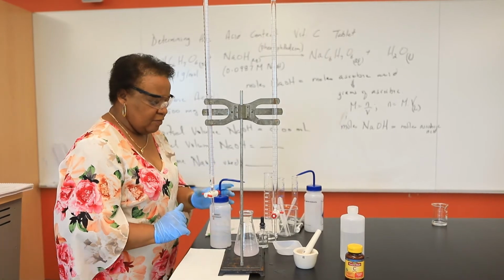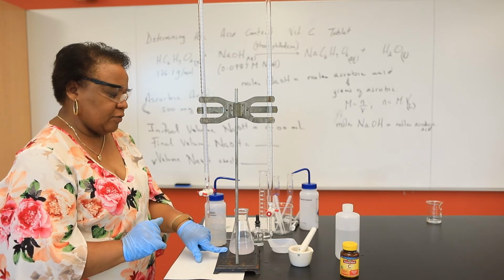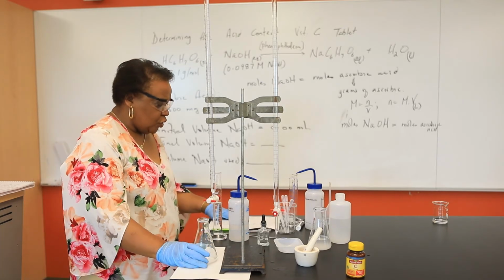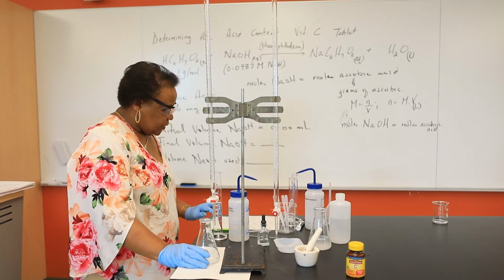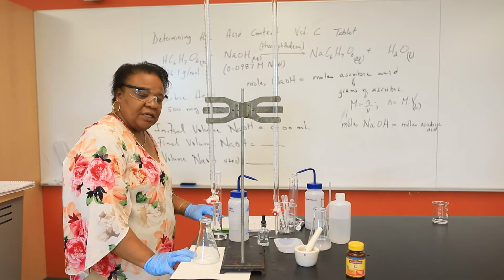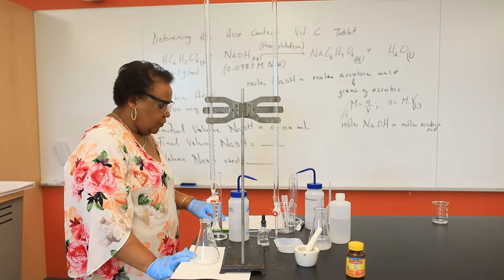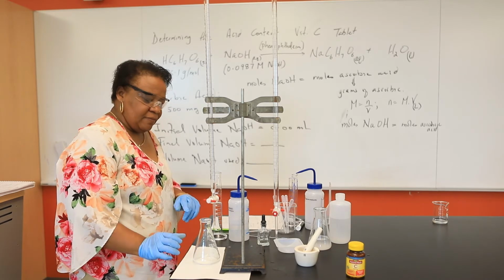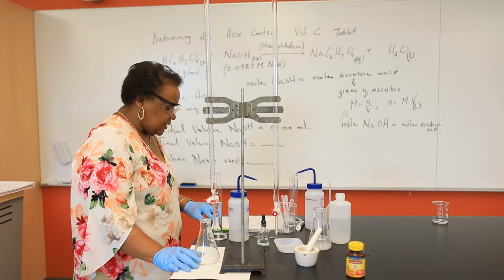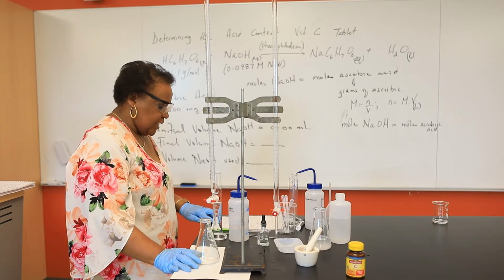I'm going to repeat the same for my second tablet, so that you can record an average later. So we're moving on to our second titration. Again, please make a note of the mass of our materials. The mass of our empty Erlenmeyer flask in part 2 is 114.665 grams. We crushed that vitamin C tablet, and the container with the vitamin C tablet is 115.322 grams.